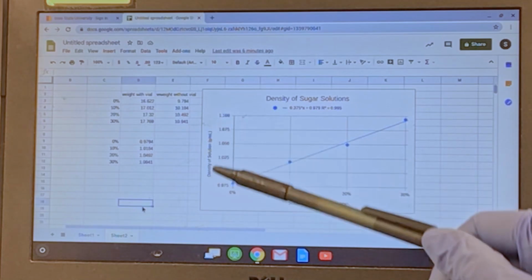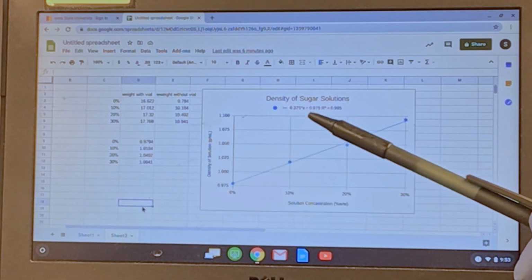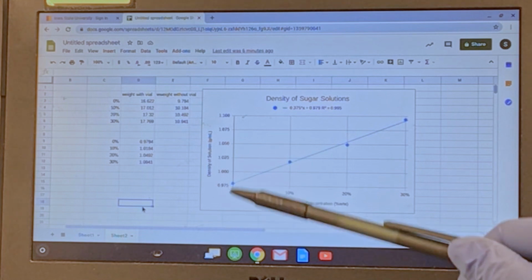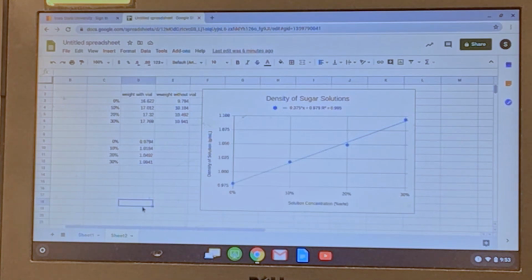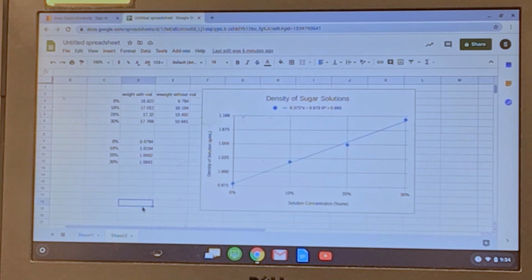So y, the density, equals 0.375 x concentration plus 0.979, which is the intercept. So the value of y at the zero value of x. And then you have the r square, which is in this case 0.995. So the r square represents how good the fit is. So how good is the equation that you choose to fit your data. The closer to 1, the better the fit. So right now I got 0.995, so it's pretty good because it's almost 1. A 0.7 will be so and so, 0.5 is really bad, okay?